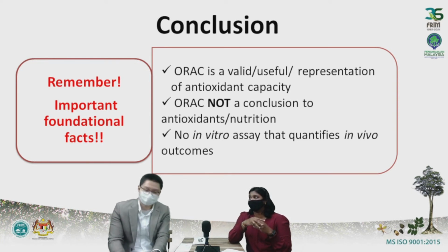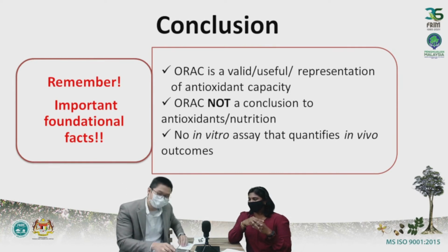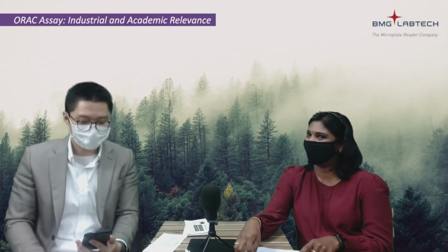Okay. Yeah. Okay. Finally, we have one question, very exciting. Question from Michael. May I know for lipophilic samples, normally whether it's better to use acetone or 50% acetone for extraction?